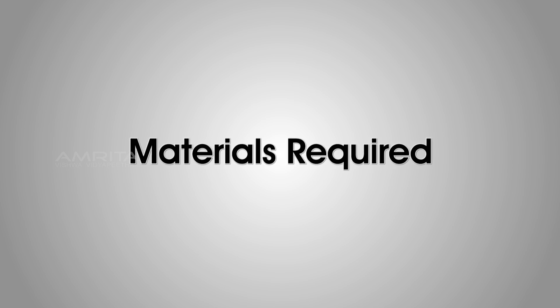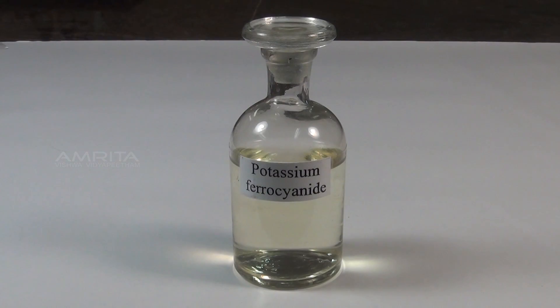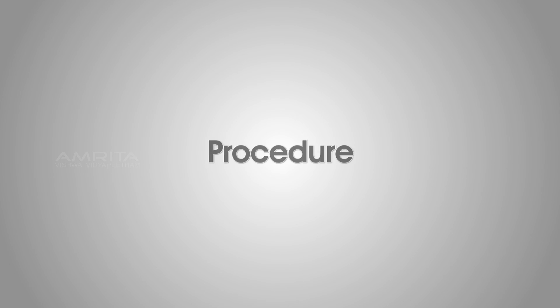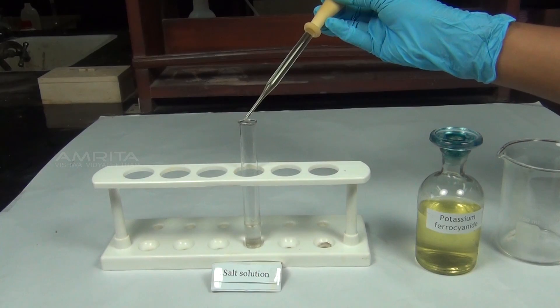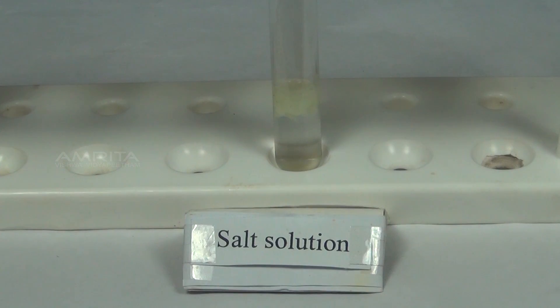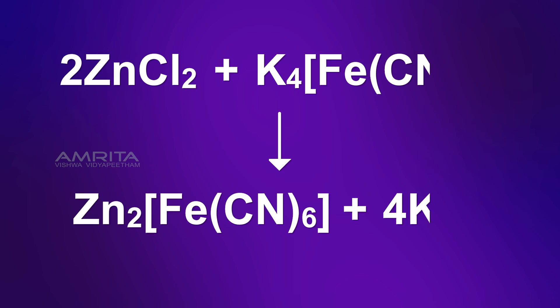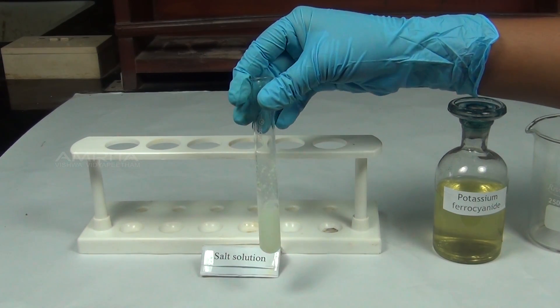Potassium ferrocyanide test. Materials required: salt solution in a test tube, potassium ferrocyanide solution, and dropper. Procedure: Take a small quantity of potassium ferrocyanide solution using a dropper and add it into the salt solution taken in a test tube. Shake the test tube well. Zinc ions present in the solution react with potassium ferrocyanide to form a white precipitate of zinc ferrocyanide.